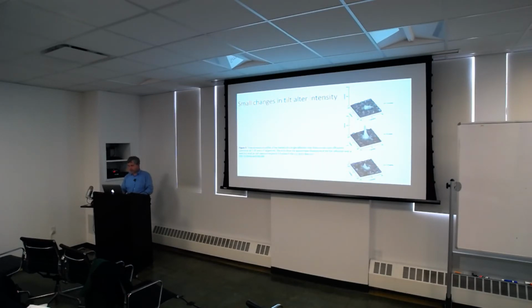Oh yeah, so this showed the limitations of the partial diffraction by their imaging. This is the same spot, and it was pretty weak, and then they had the full intensity at one angle, and then they tilted another 0.1 degree. This is minus 0.1 degree, 0, and 0.1 degree. So this is the problem of the partial reflections, where this is all the same reflection. If you oscillated it, this all would have been integrated. But because it wasn't, they had to figure out what the intensity of this spot should have been.